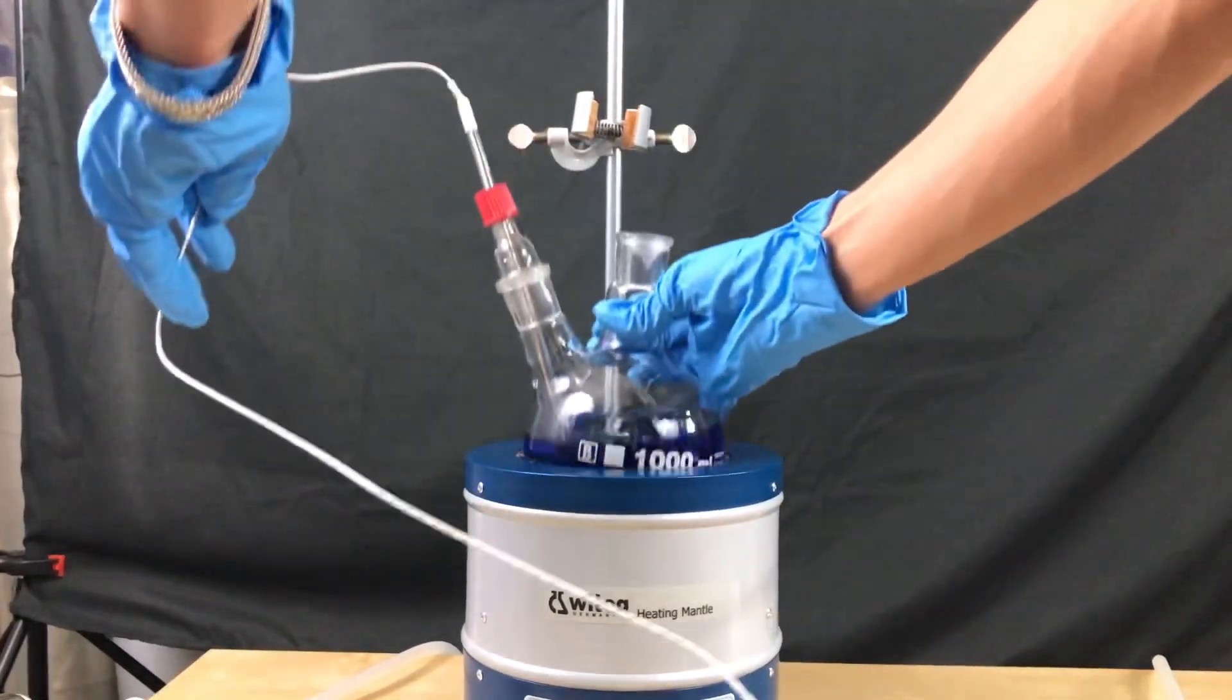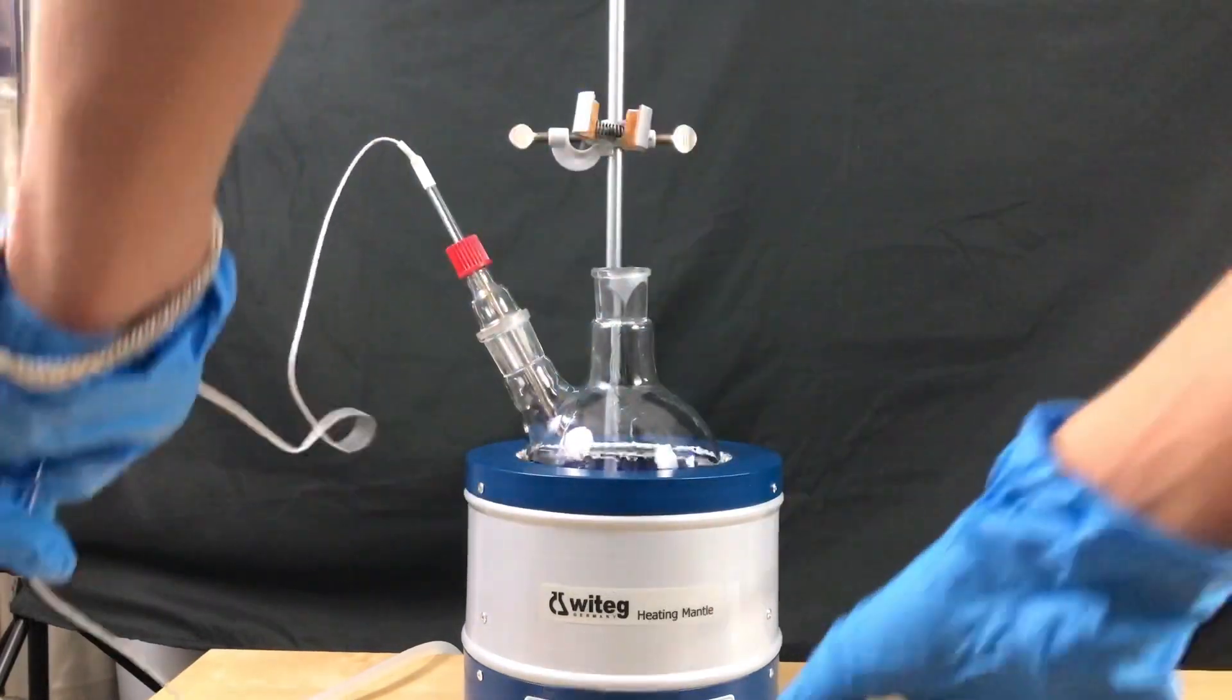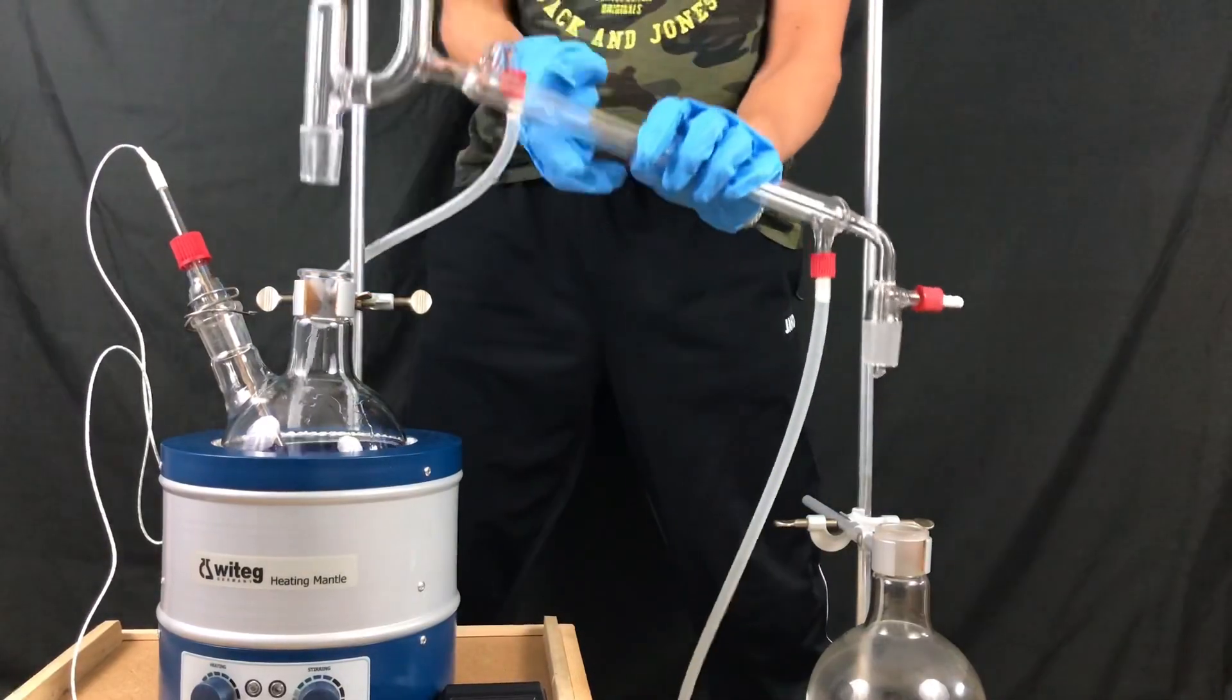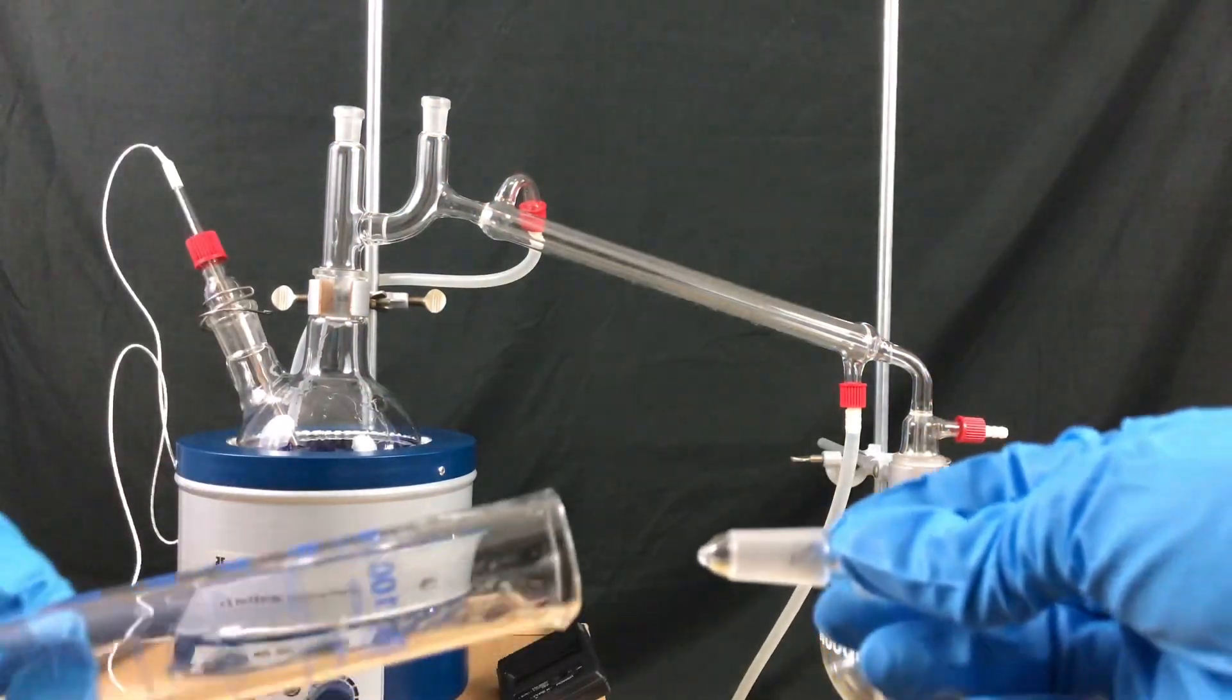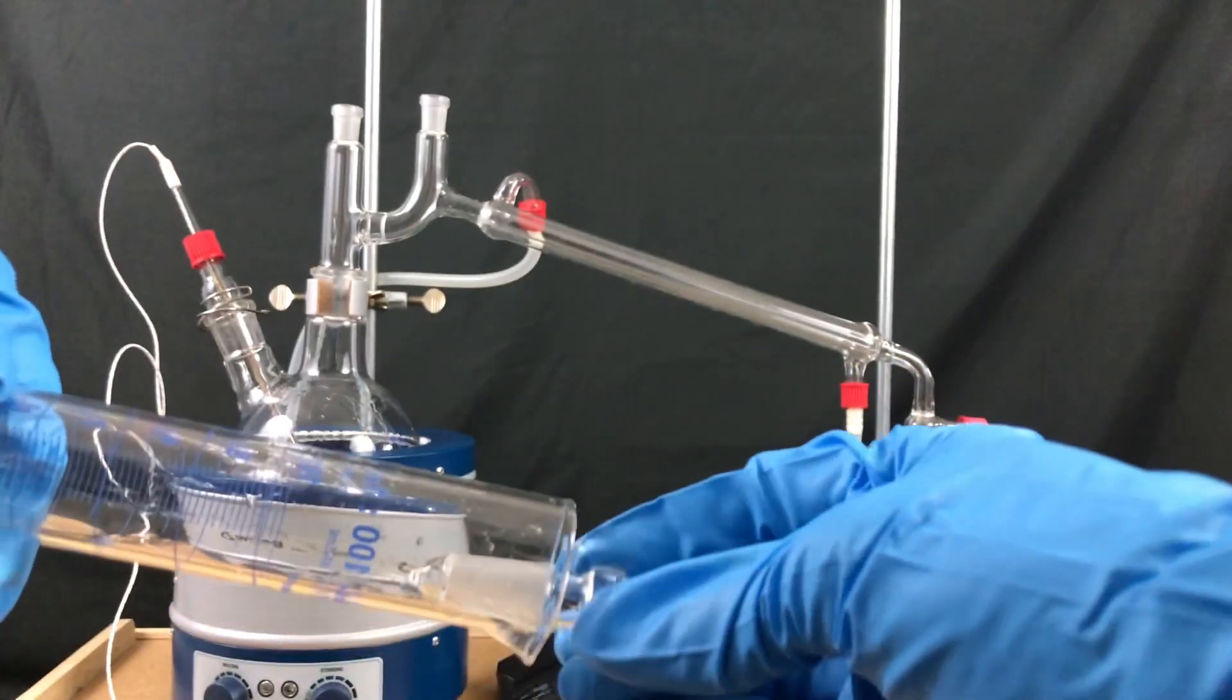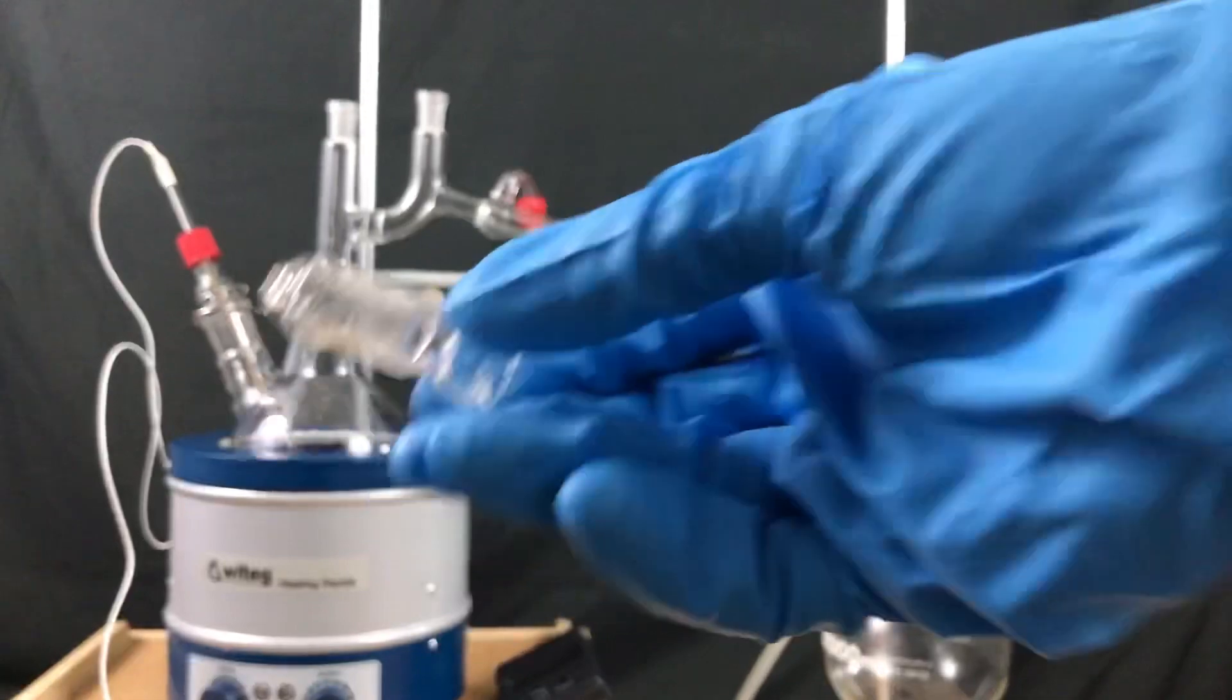Then the flask was put into a heating mantle with an integrated magnetic stirrer. I didn't show it in the video but a magnetic stirrer bar was added beforehand. A distillation bridge was put into place. I covered the ground glass plugs in sulfuric acid to make sure that no dioxane vapor escapes from our apparatus.